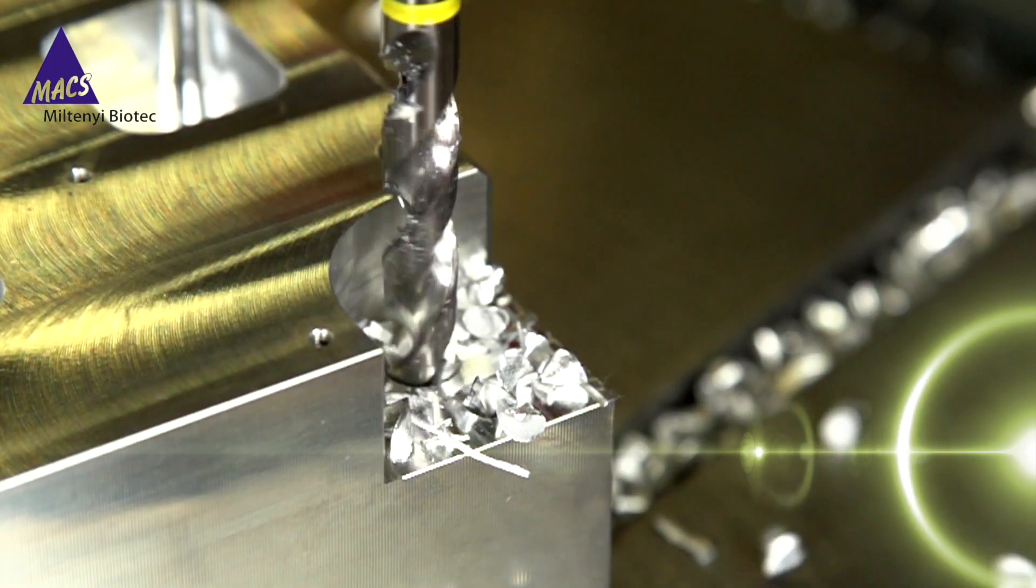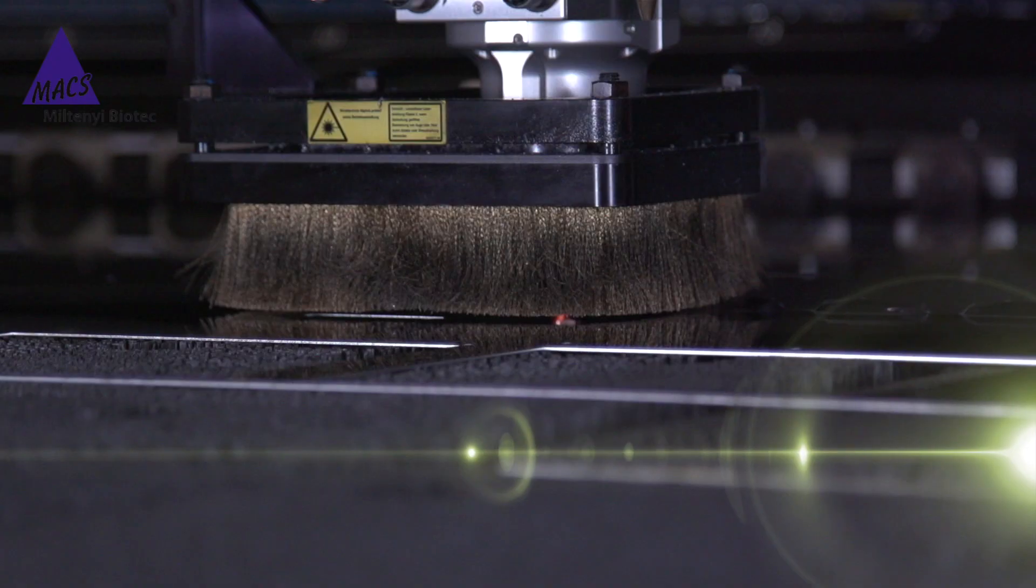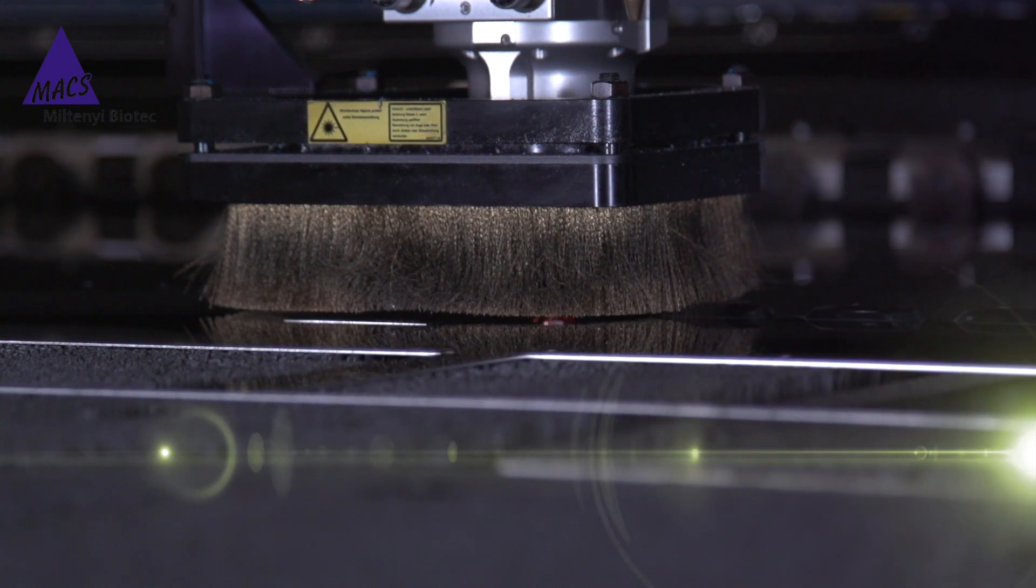Speed alone means little. Without precision, without function, without the right operator, speed is wasted.